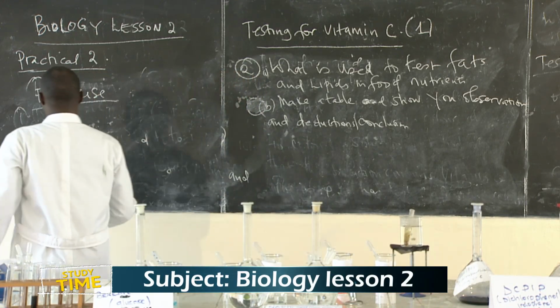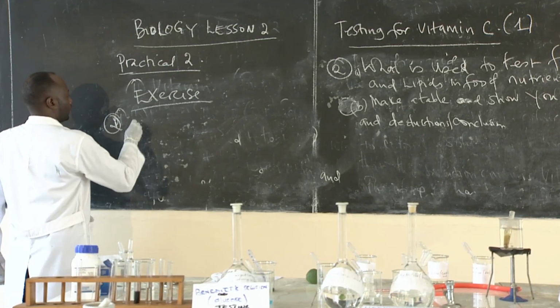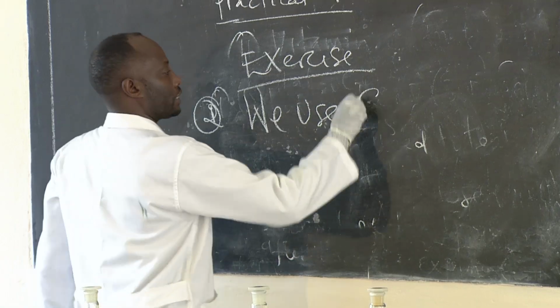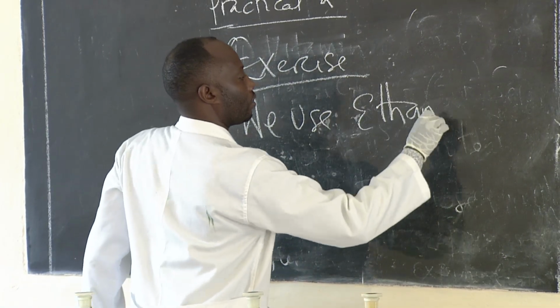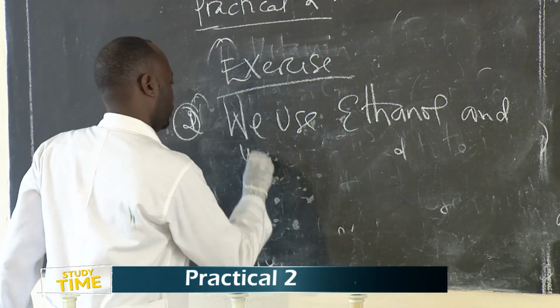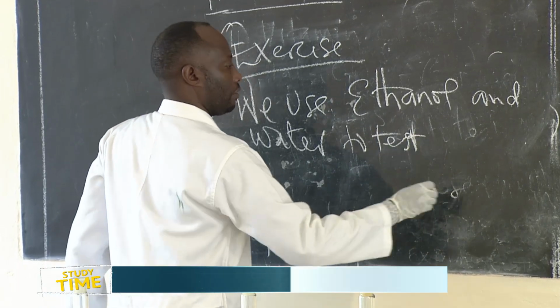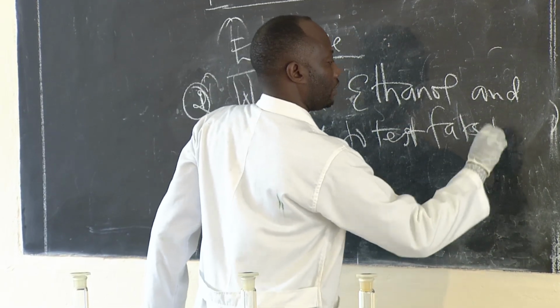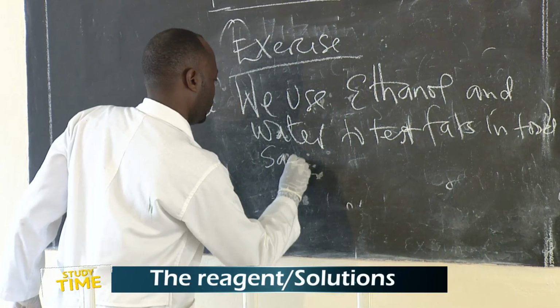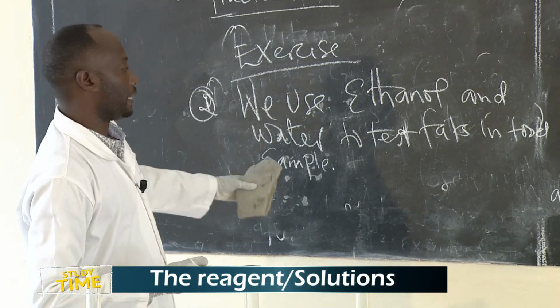We use ethanol and water to test fats in the food sample. Good.